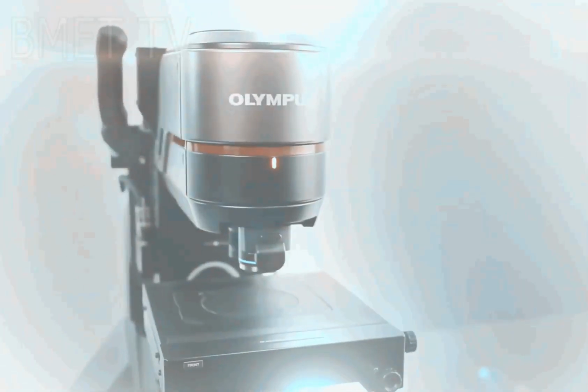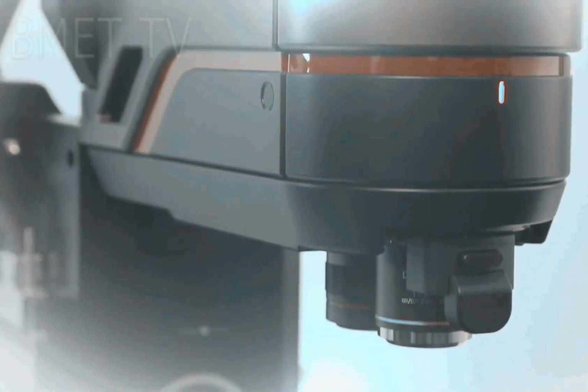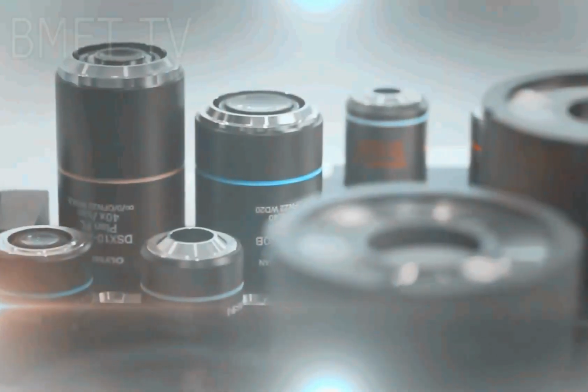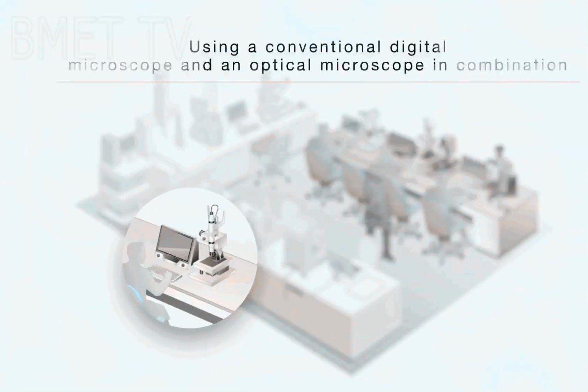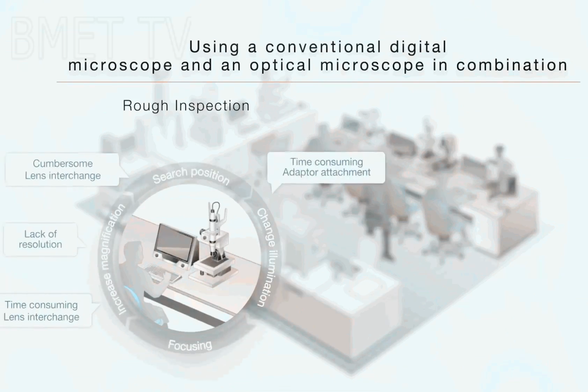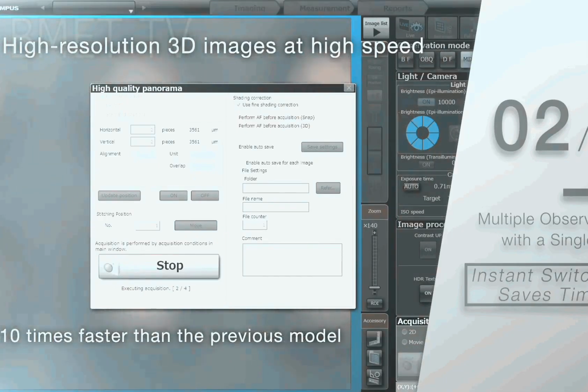Step into the 21st century with a digital microscope and enter a world of amazing detail. The digital microscope, invented in Japan in 1986, uses the power of the computer to view objects not visible to the naked eye. Among the different types of microscopes, this can be found with or without eyepieces to peer into. It connects to a computer monitor via a USB cable, much like connecting a printer or a mouse. The computer software allows the monitor to display the magnified specimen. Moving images can be recorded or single images captured in the computer's memory. An advantage of digital microscopes is the ability to email images as well as comfortably watch moving images for long periods.